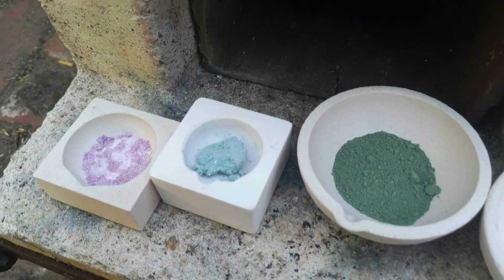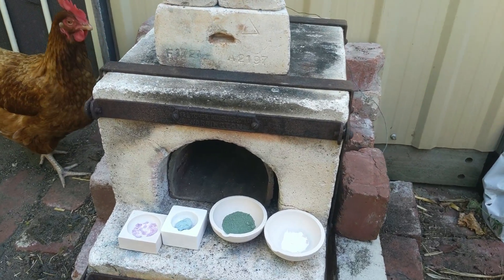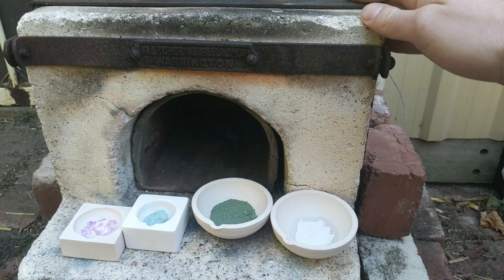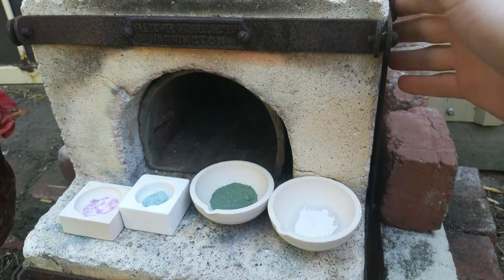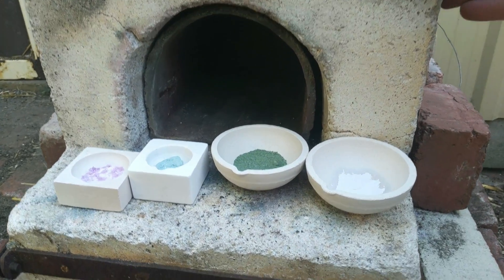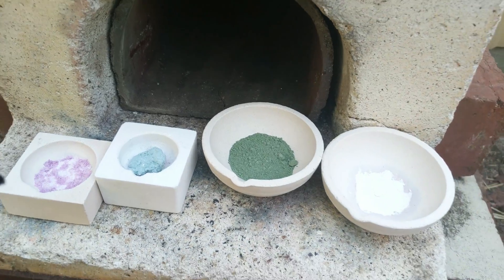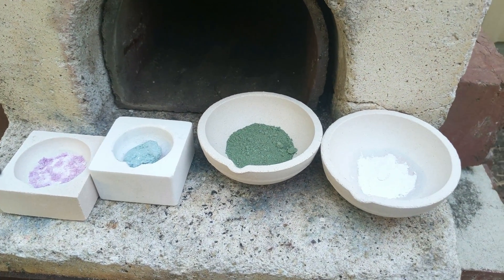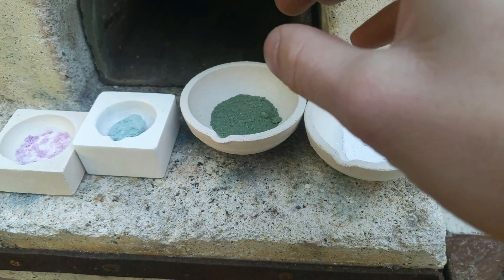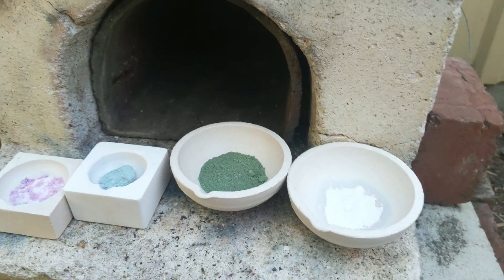Here we have our cobalt mixtures in the little crucibles and I'm just about to load them into the forge. I need to get rid of the chickens first — we don't want them near that. This old forge was acquired at some point by my dad and I just inherited it; I think it's from the early 1910s but it still works pretty well. I've made up some little pieces of kiln shelf to use as lids because it's important to make sure none of the fire gases get into the pigments as they can damage them.